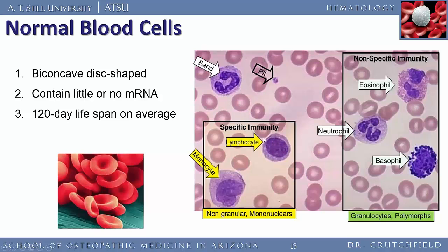Here are some of the various types of cells that we're going to learn about. So we know the red cells, these guys right here. These are normal looking red cells. They look pretty good. The reason you see that little glow in the middle is because the center of the disc is reflecting back at us. But that becomes important in someone who has anemia, who may not have enough iron, and then you're going to see that reflective surface almost completely envelop the entire red cell. We have a lymphocyte, we have monocytes, we have basophils. Notice the granules here. We have a neutrophil, which is a white blood cell. We have eosinophils with all these little granules that are getting ready to release histamine for our allergic reaction.